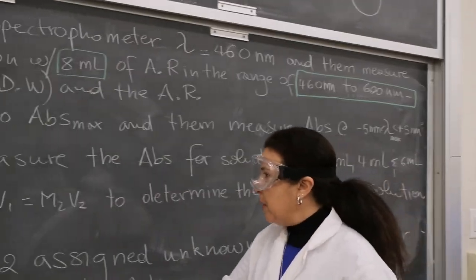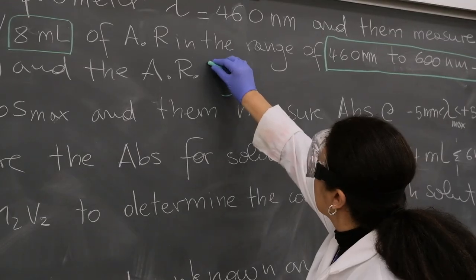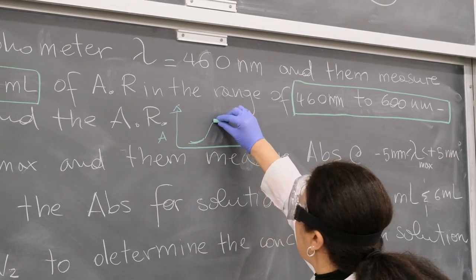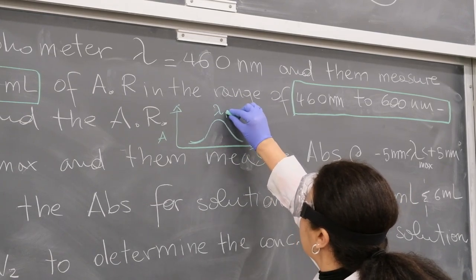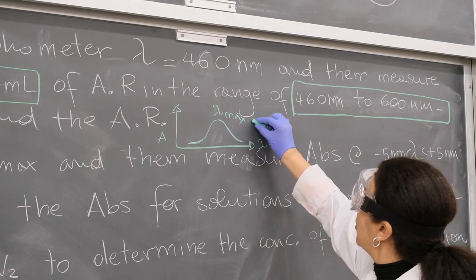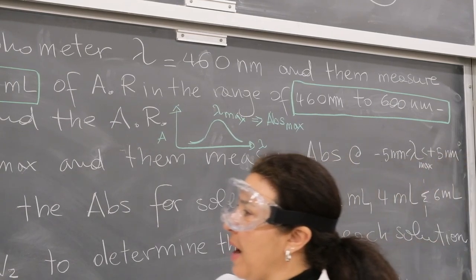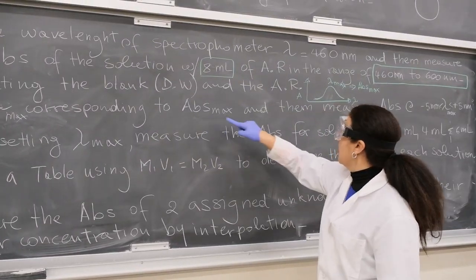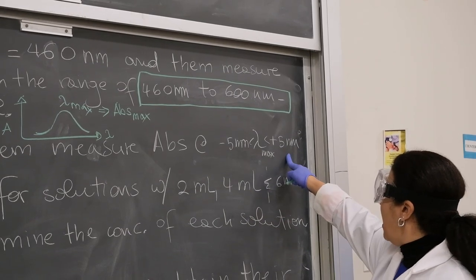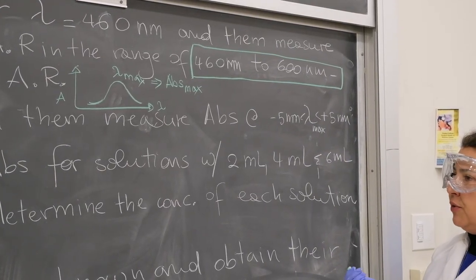600 nanometers. Now you will see that your solution will start to increase in absorbance. So as the wavelength increases, the absorbance increases, reaches a maximum, and then decreases again. This is going to be your lambda max, okay? Which is the wavelength at which you measure the max absorbance. Once you find the lambda max, to which corresponds the highest absorbance, then you measure the absorbance at a value of lambda that is 5 nanometers less and then 5 nanometers more, and you pinpoint which one is the perfect wavelength that you need for your measurements.